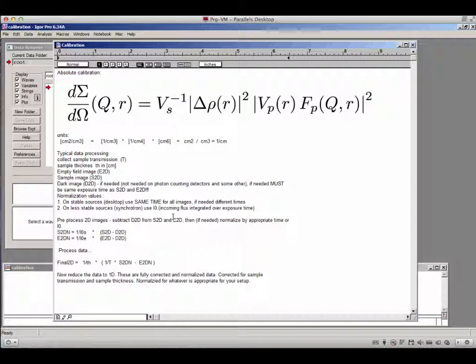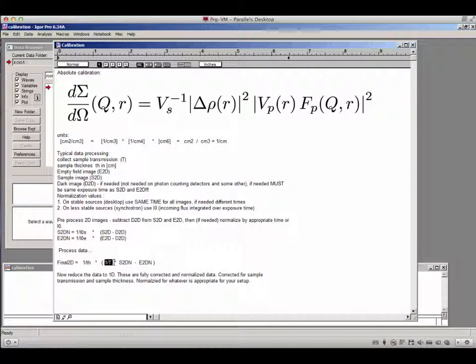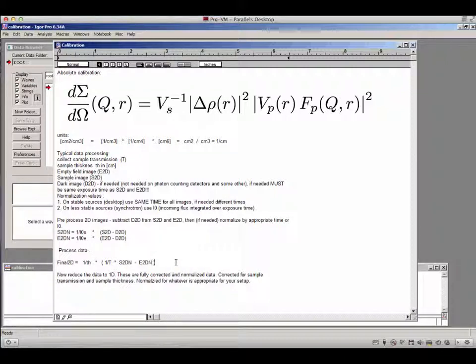Sorry about the typos. You don't have to do all these calculations in 2D — it is entirely valid to start by reducing 2D data to 1D and doing all calculations in 1D. This should be done by data reduction software. Just make sure the software correctly handles sample thickness and sample transmission. If you want a package that does this correctly, you can use the NECA package I wrote for Igor Pro.